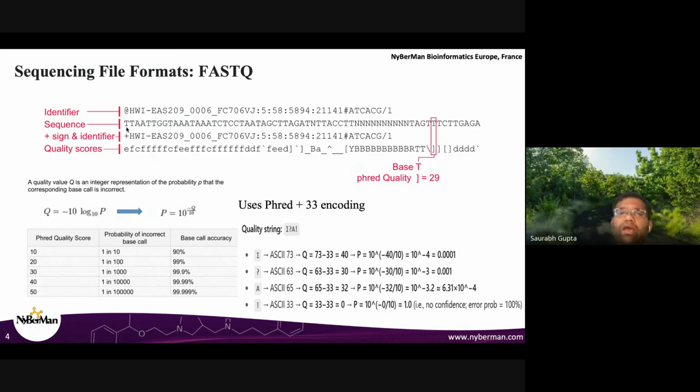Okay, and whenever a T nucleotide would be added, the red fluorophore would be released. But when the camera takes a picture, the intensity of the red can vary, let's say when this T is added, or this T, or this T and this T, and so on.